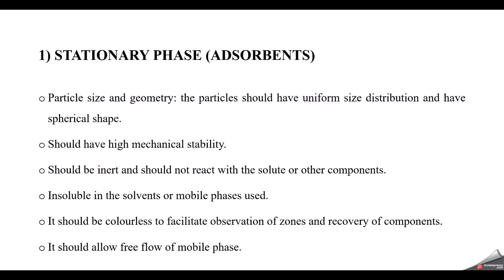Particle size and geometry. The particles should have uniform size distribution and be spherical in shape. It should have high mechanical stability. It should be inert and should not react with the solute or other components. It should be insoluble in the solvents or mobile phase used. It should be colorless to facilitate observation of zones and recovery of compounds. It should allow free flow of mobile phase.